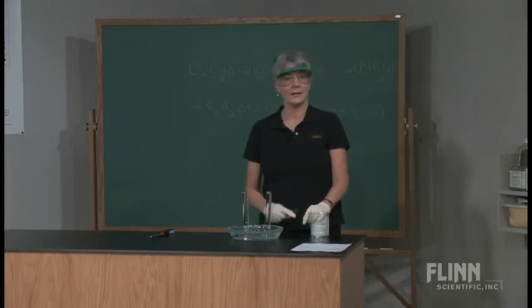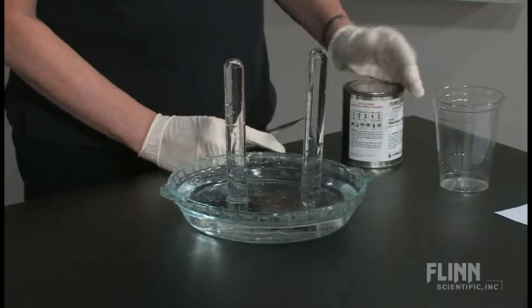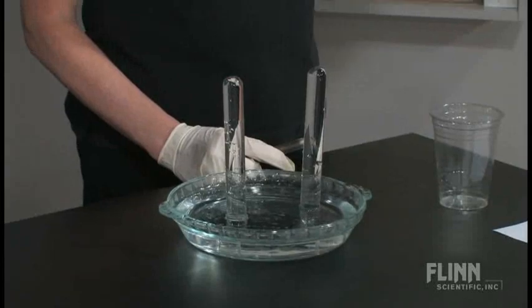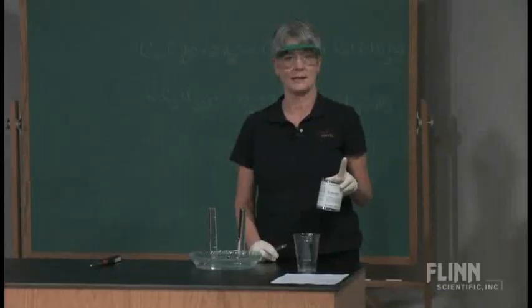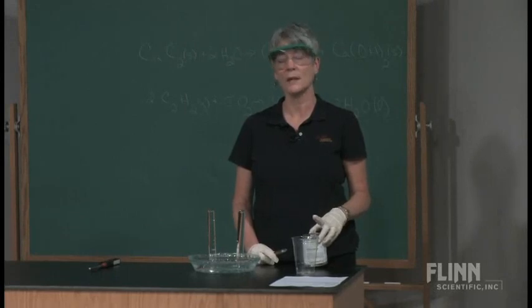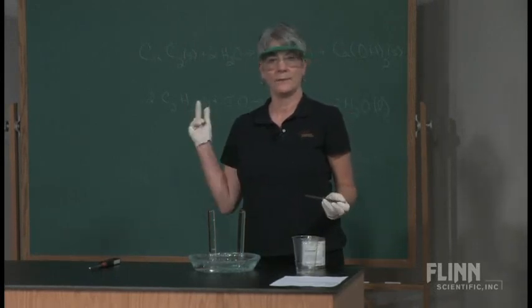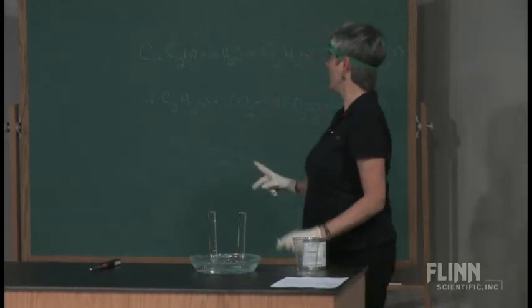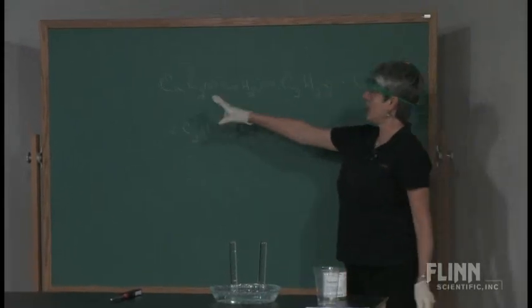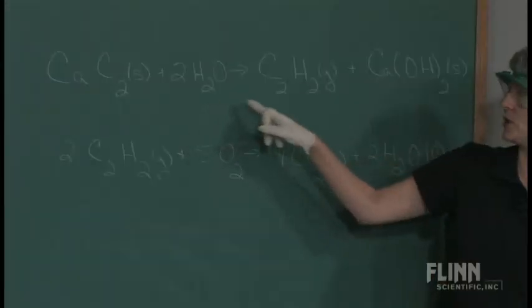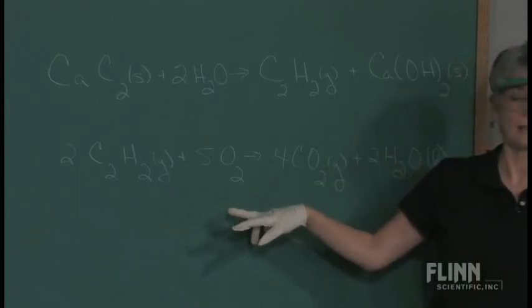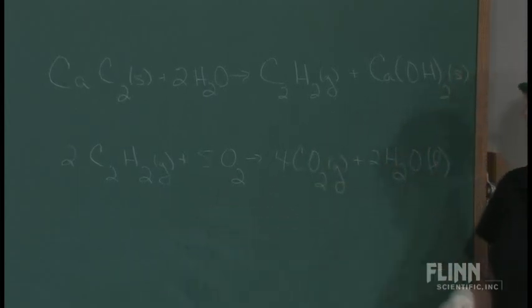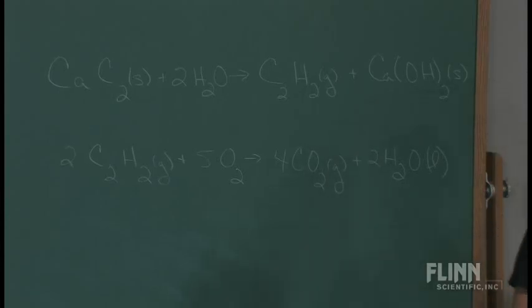What I have is two large test tubes that are just full of water in a pie dish, and I'm using calcium carbide. Now calcium carbide reacts with water to produce acetylene gas. If you look at the board behind me, what I'm really doing is I've got the calcium carbide generating the acetylene gas, and then I'm going to burn the acetylene gas. So that's what's going to happen with the gas that I collect in the test tube.